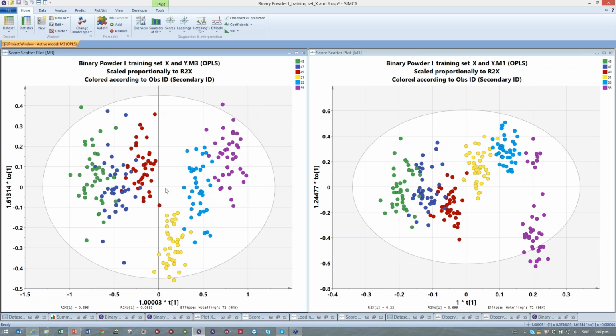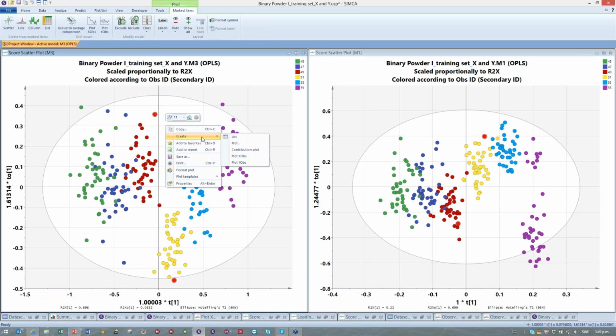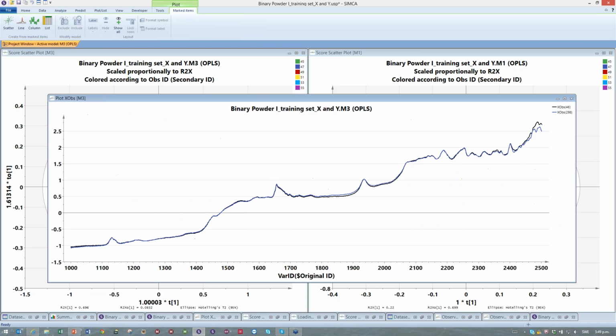We still seem to have a little systematic shift now for the batch that is colored using a yellow color, which would be the 51% batch. We can do a similar thing. We can plot spanning batches just to see, or spanning samples, to see where the differences are. And now there is some segregation in the upper or high numerical end of this wavelength window that is used.